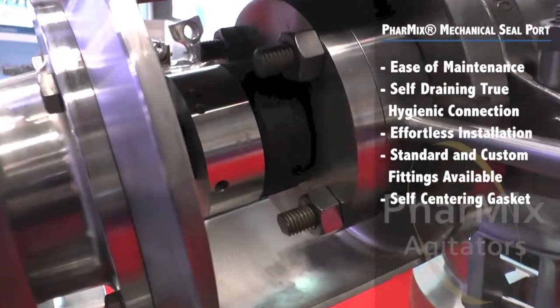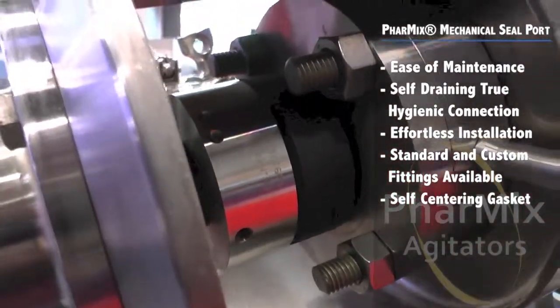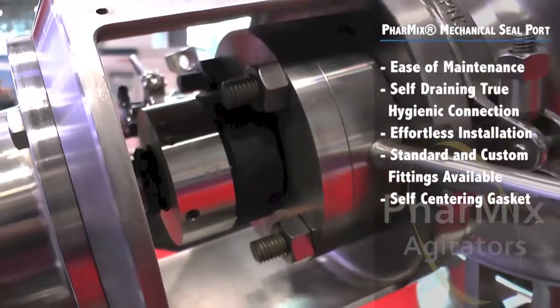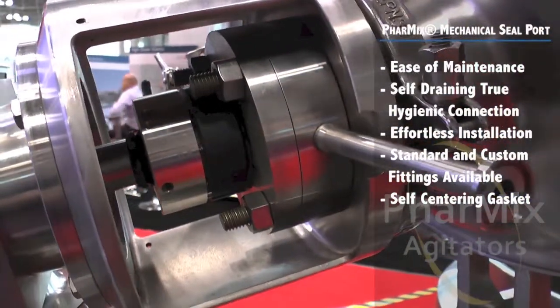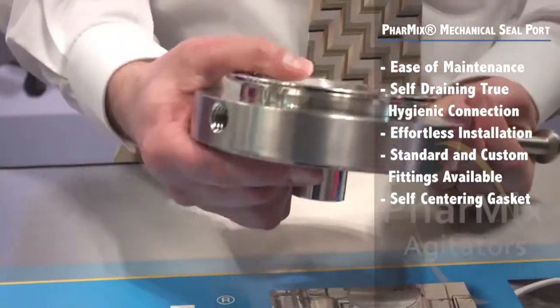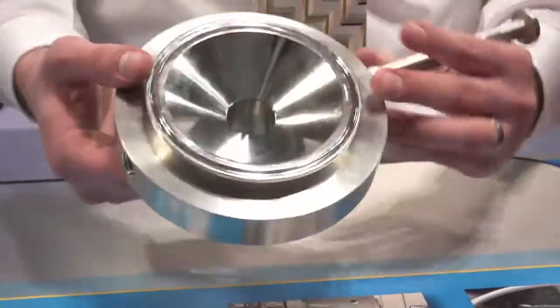The snap-on self-centering gasket design makes installation easy. The low-friction tough steel gasket won't bind, ripple, or compress when tightened. The Farmix MSP is available in a standard half-inch hygienic tri-clamp fitting connection, and other fitting styles are available.